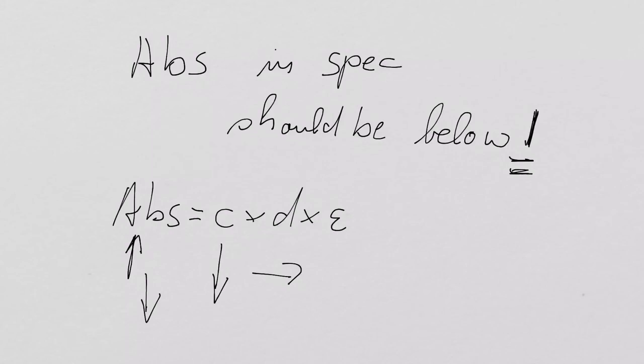This is sort of shorthand for what's actually happening with the arrows. Does it make sense? So when you do an experiment, I don't want ever to see a result where the absorbance is 2.95. You just as well could pick any random numbers. It doesn't make sense. Does that make sense to you?